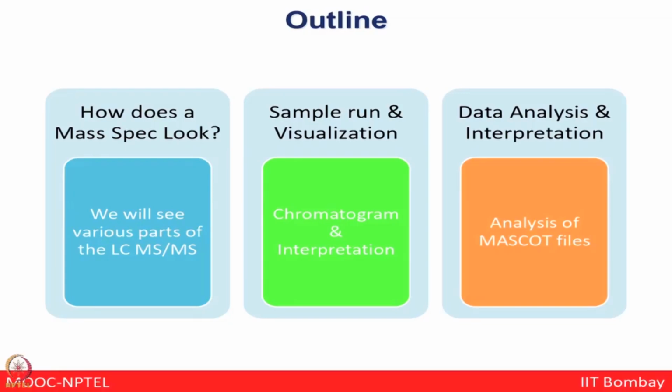So, today's lecture I am going to talk to you about MS based proteomics workflow, and here the interest will be also to give you some idea of how to do sample preparation and protein quantification in laboratory settings. So, first we are going to talk about how a mass spectrometer works, various components of LC and MSMS, then the sample run and visualization, how to look at the chromatograms and do data interpretation, and finally data analysis and interpretation using a free tool Mascot.